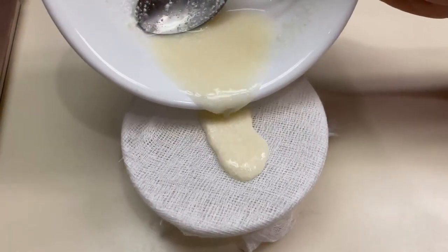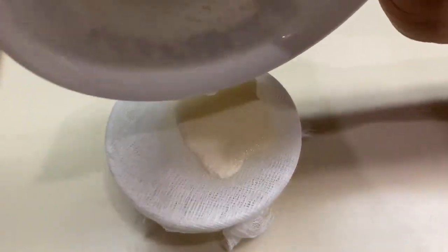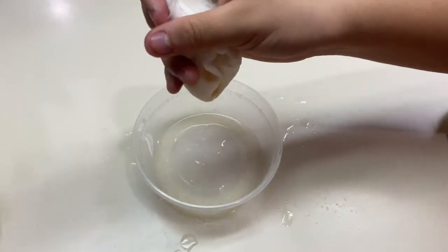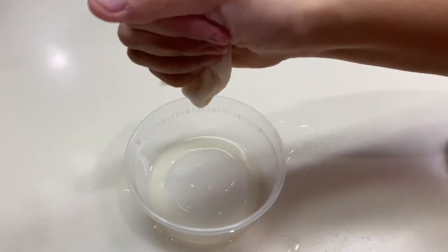Filter the mixture into a cup by pouring it through a cheesecloth or handkerchief, which is fastened with a rubber band over the mouth of the beaker. Remove most of the water from the precipitate by squeezing the cloth gently. Discard the filtrate.